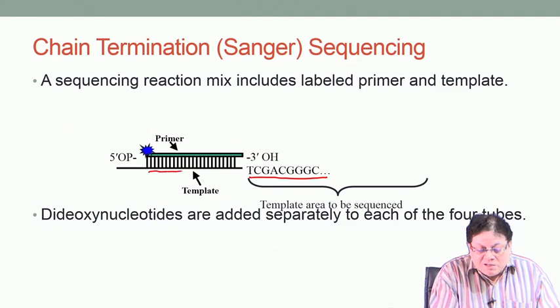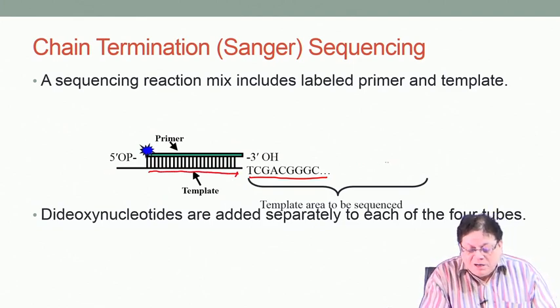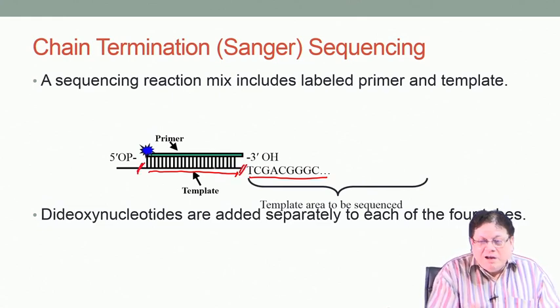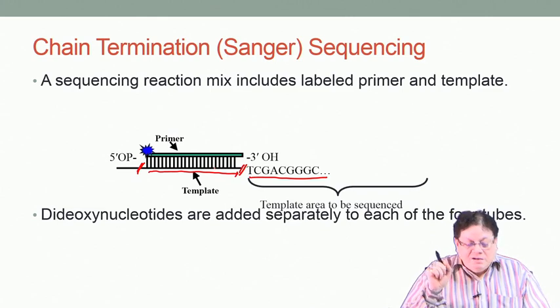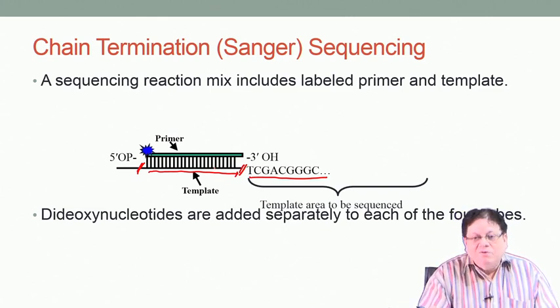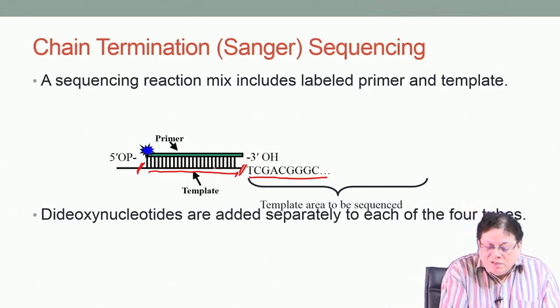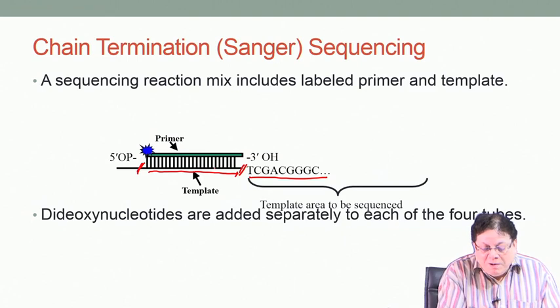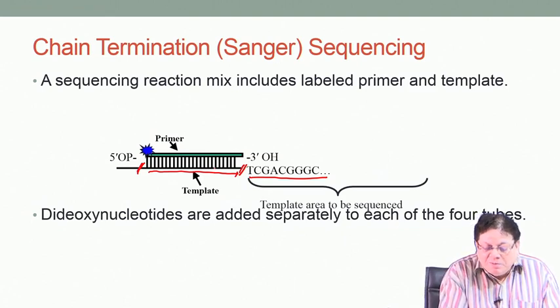This part is what is called the primer. So, when I have the DNA, it goes up to that point, that means I know the sequence up to this part. So, accordingly I synthesize, there are ways of synthesis of oligonucleotides. So, I will synthesize the oligonucleotide which is complementary to this part of the DNA.